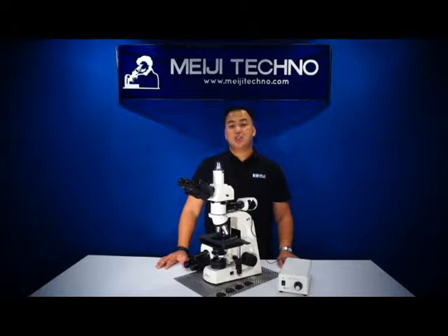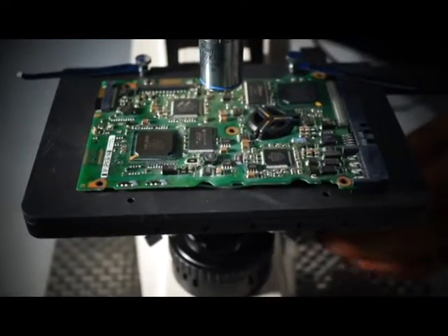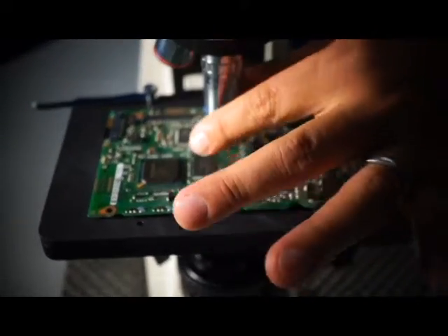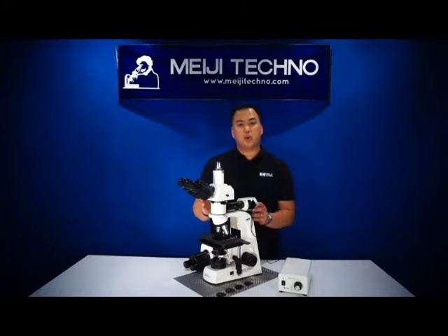The MT-8000 series is a suitable instrument for most applications involving research such as inspection of cross-sections of circuit boards, electroplating coatings, grain size morphology, and inclusion defects. Really, the range of specimens falling into this microscope category is enormous.